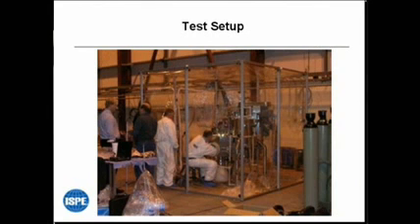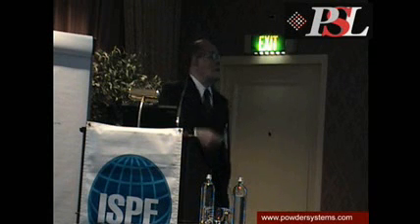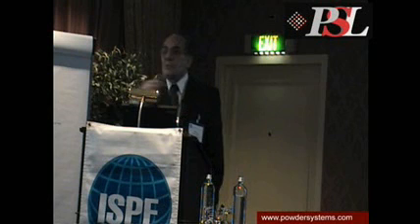There's the whole setup. We did the background samples for 3 hours. We went in, we did the operation for 3 hours. We took the filter dryer out. We recharged it. We put it back in. We did backgrounds for 3 hours, sample for 3 hours, took it out, recharged it, put it back in.